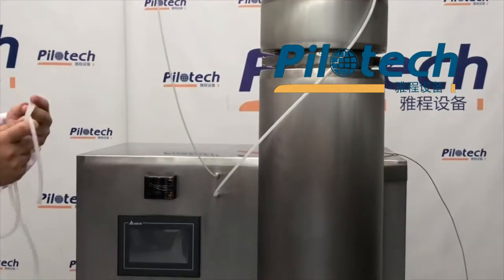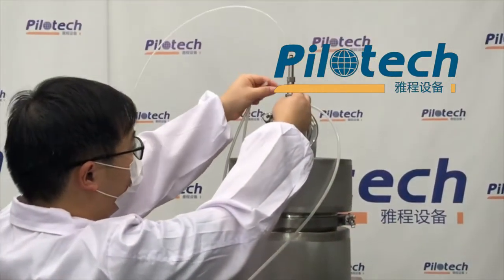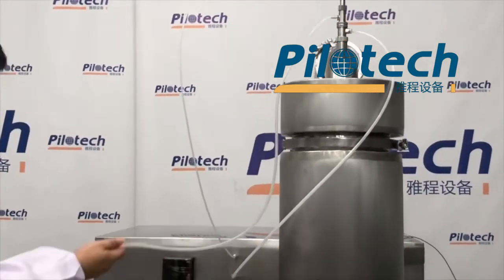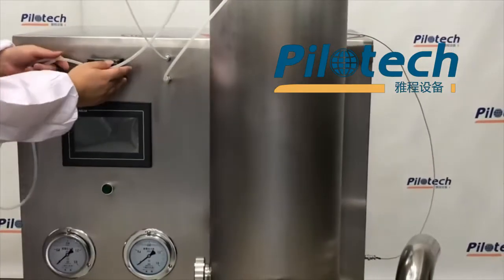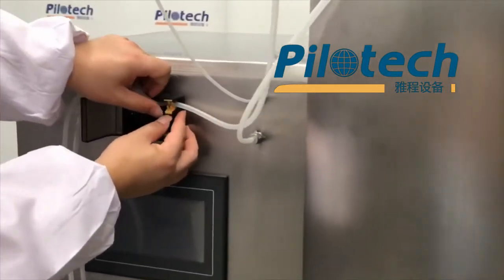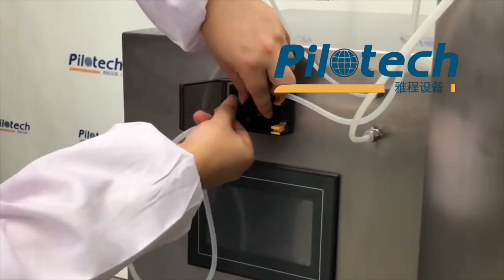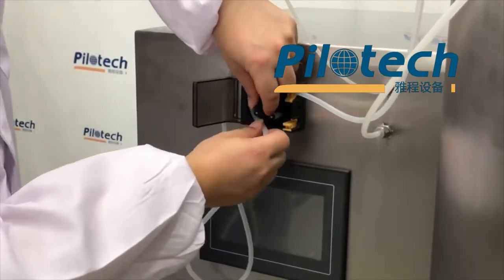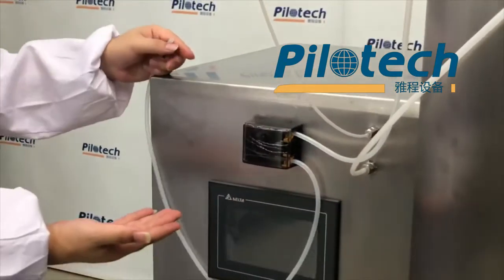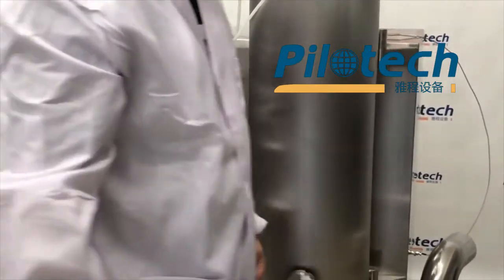This one is the feed tube. It is used for material feeding. We need to install it on the left of the atomizer. Fix the feed tube in the peristaltic pump, then put the feed tube in the material container.